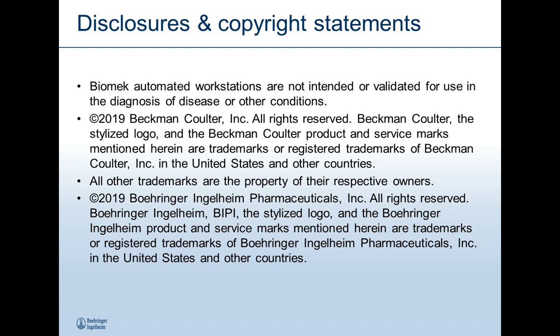And those can be done with basically the same protocol with just a different source reagent. And that's probably one of the easiest methods to set up within the Biomek software. That gets obviously a little bit more complicated if you start integrating components on deck within a Biomek or any other liquid handler as part of an integrated system.